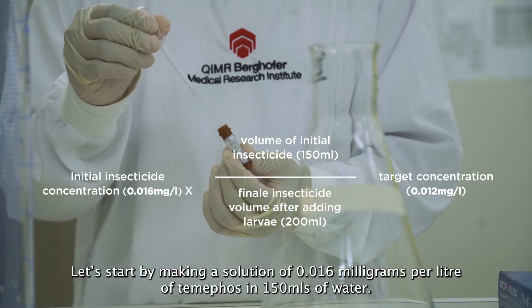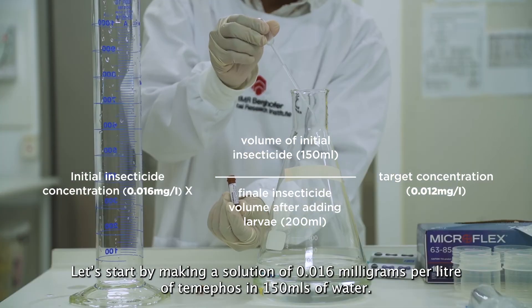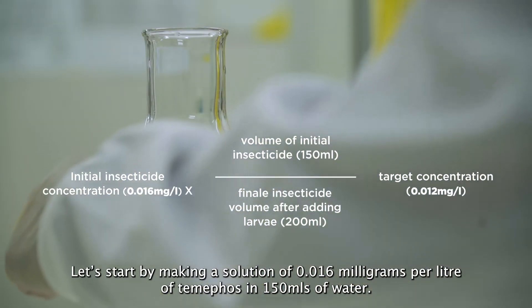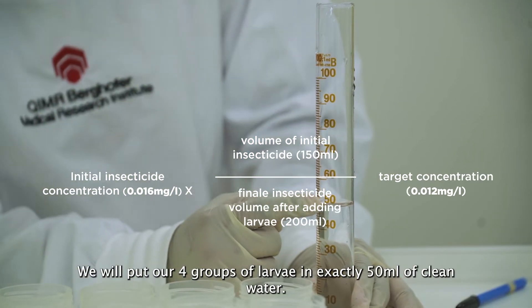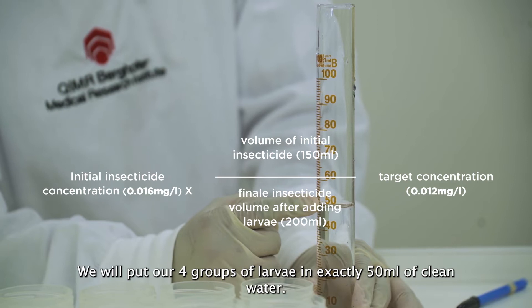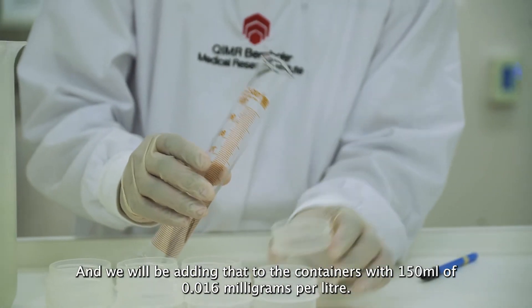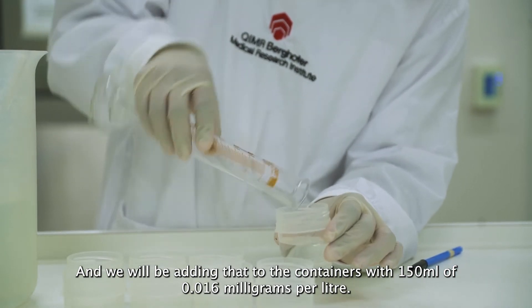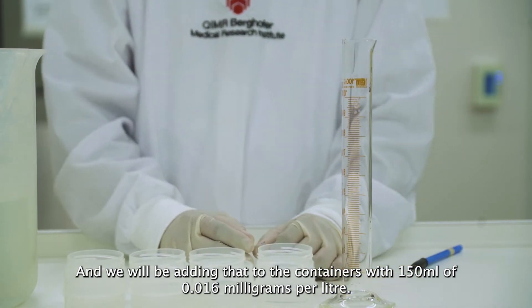Let's start by making a solution of 0.016 mg per litre of Temephos in 150 ml of water. We will put our four groups of larvae in exactly 50 ml of clean water, and we will be adding that to the containers with 150 ml of 0.016 mg per litre.